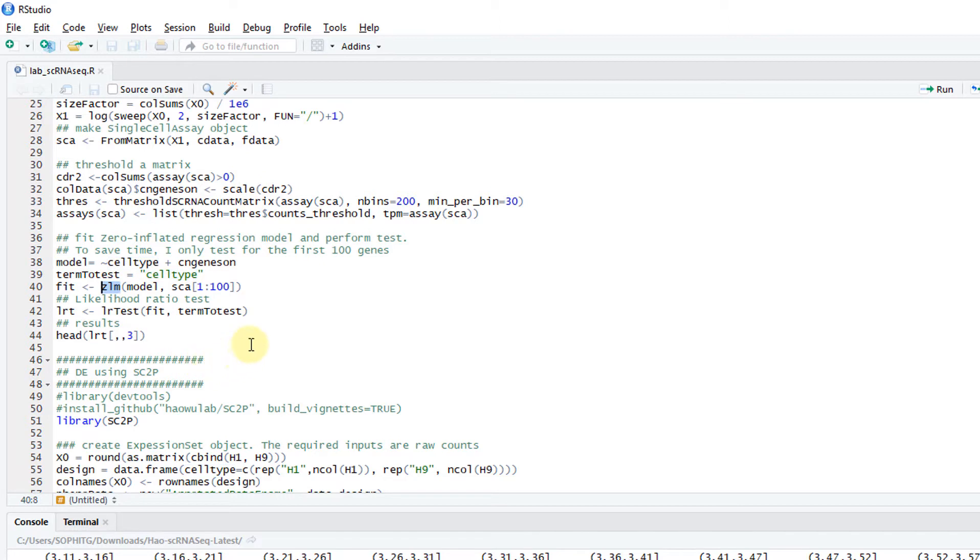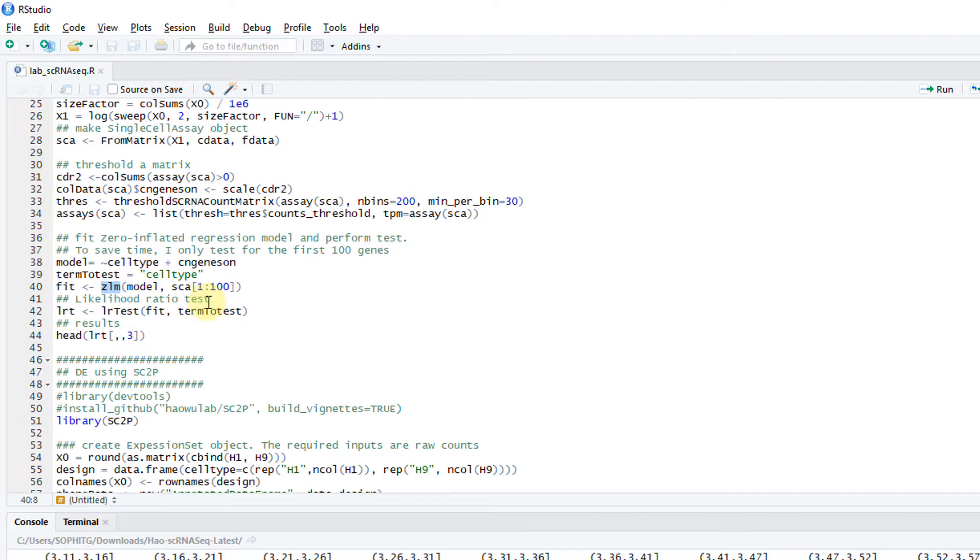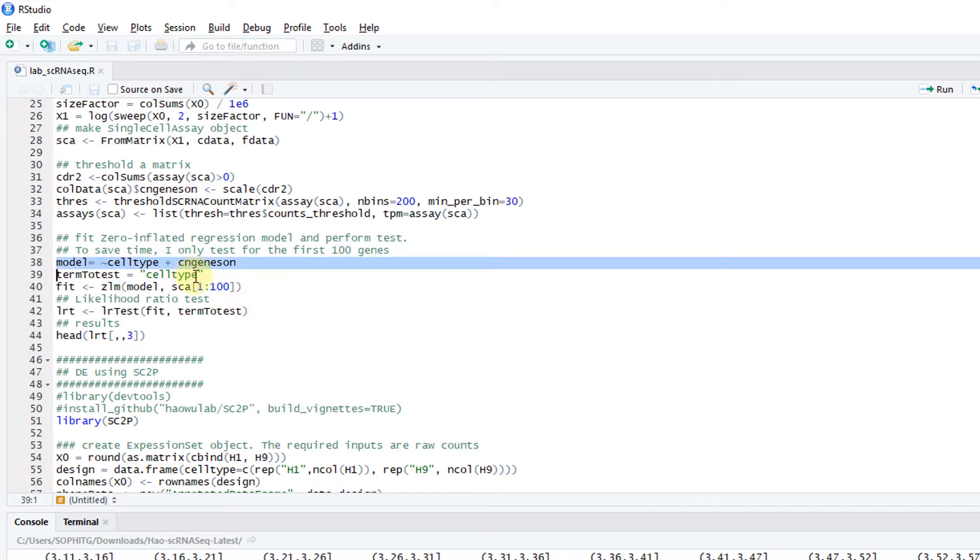Then ZLM is the main function. Use this function to do differential expression test. MAST is pretty slow. If you do the test for the whole dataset, it takes maybe 10 minutes. To save time, I only test the first 100 genes.